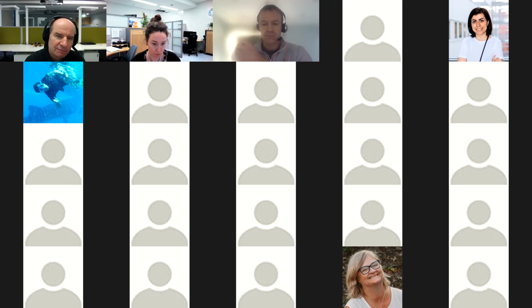I would guess not, but no, I was thinking more of a possibility of sometimes using it as a local image viewer, because its functionality is really convenient. Usually I have to drag and drop every single image if I want to check. So if it's possible to view everything in one window setup, that would be really convenient. But I'm not planning to go through the whole process of setting everything up. So it sounds good either way.